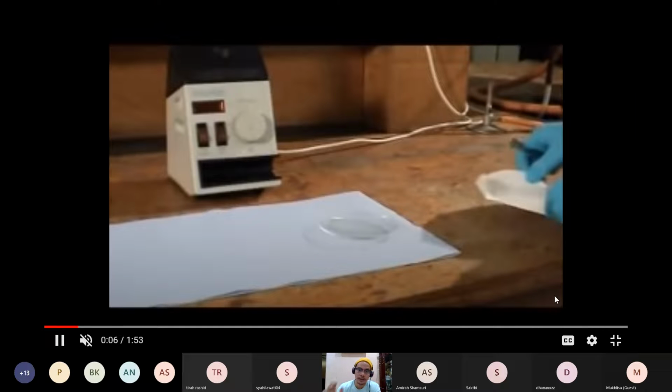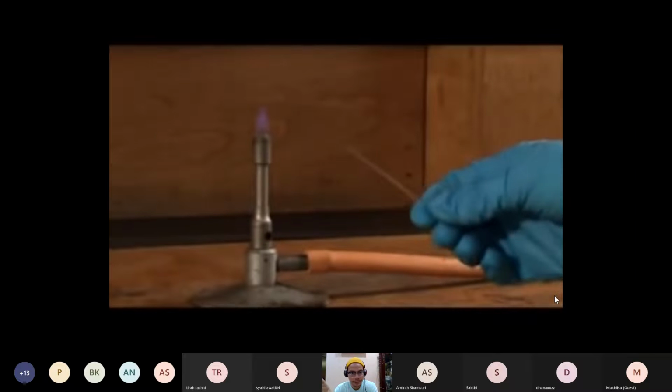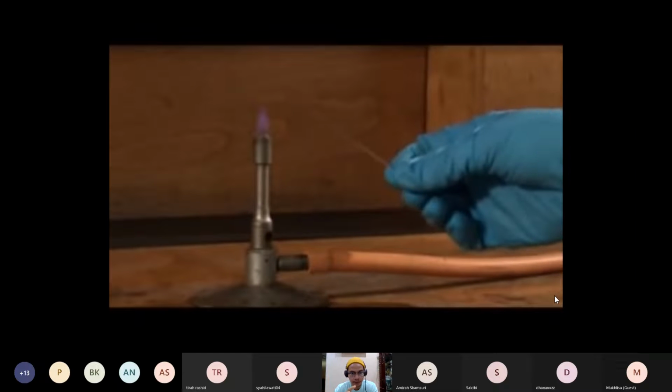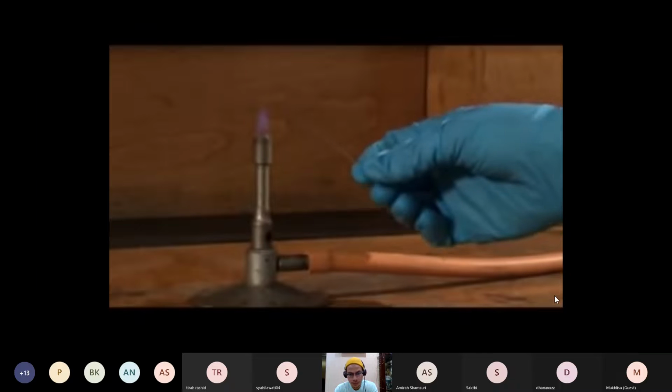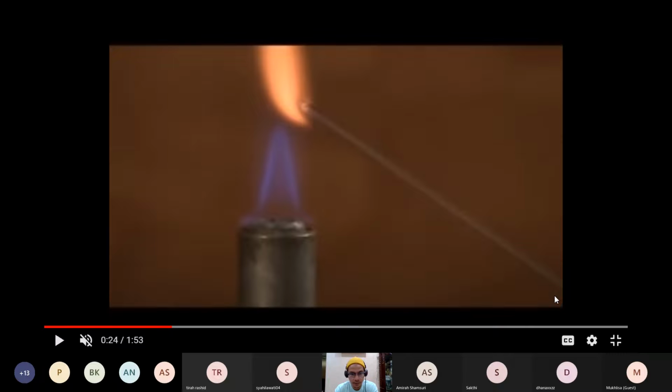Okay, so now this test, this is how we perform melting point test. Kita perlukan just a simple setup. Kita perlukan melting point apparatus. Kita perlukan satu small thin yang dia tengah panaskan dalam screen sekarang ni, a capillary tube, just a glass tube yang mana both ends terbuka. So kalau kita nak masukkan tablet, serbuk tablet dalam capillary tube ni, kita mesti tutupkan on one end.